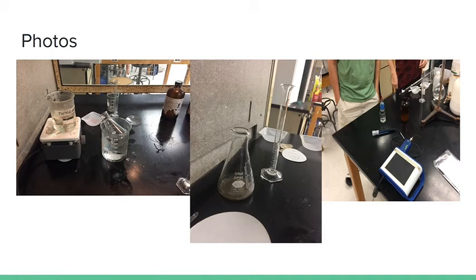So we placed around 0.3 grams of the lab-synthesized acetylsalicylic acid, the Bayer aspirin, and the generic drugstore aspirin, respectively, in 100 milliliters of water, and then we used the pH meter to measure the pH once it was all dissolved. However, there were still some portions that weren't dissolved, which is understandable, considering it's a weak acid with a small Ka.